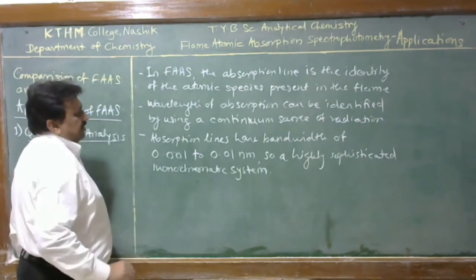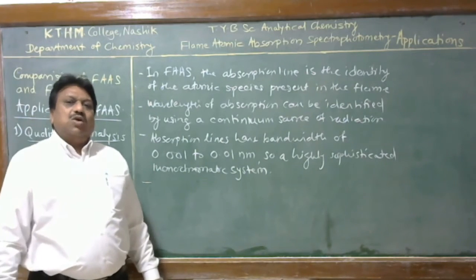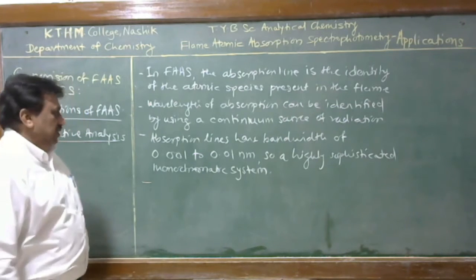And in this way, in atomic absorption spectrophotometry, the qualitative analysis is carried out.